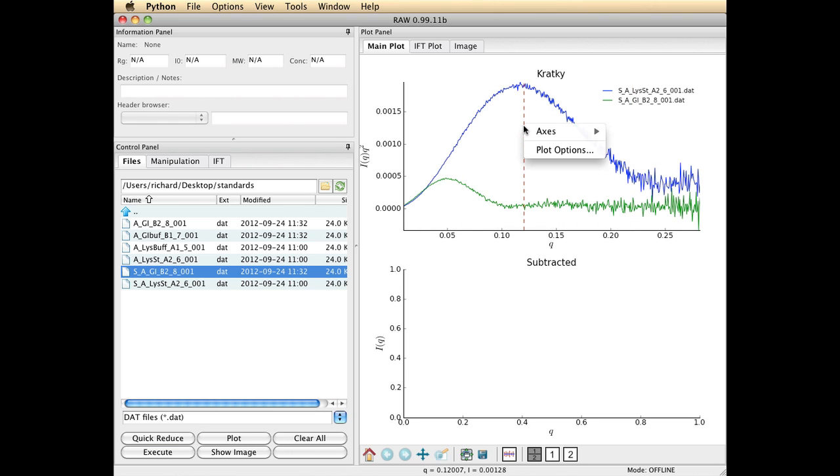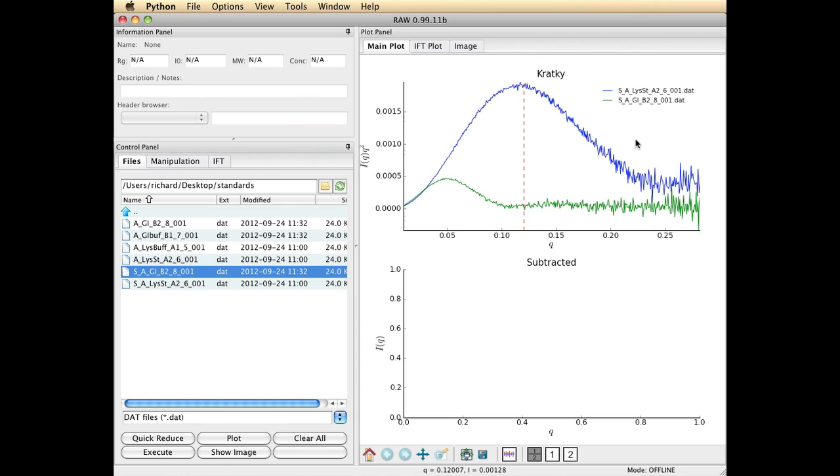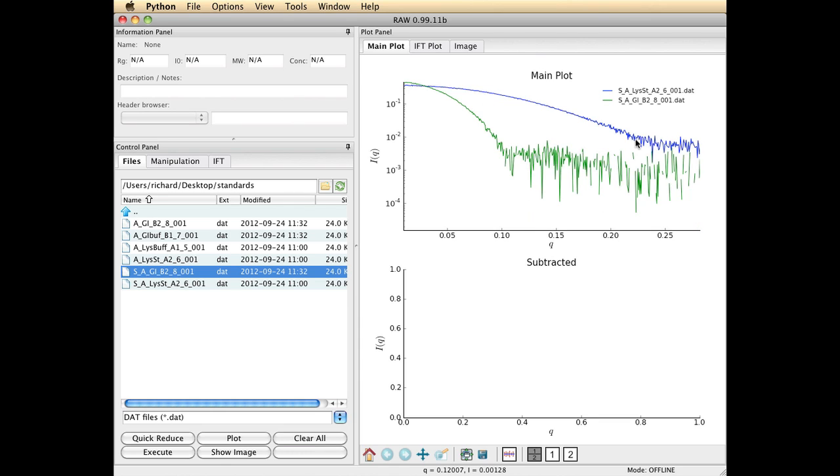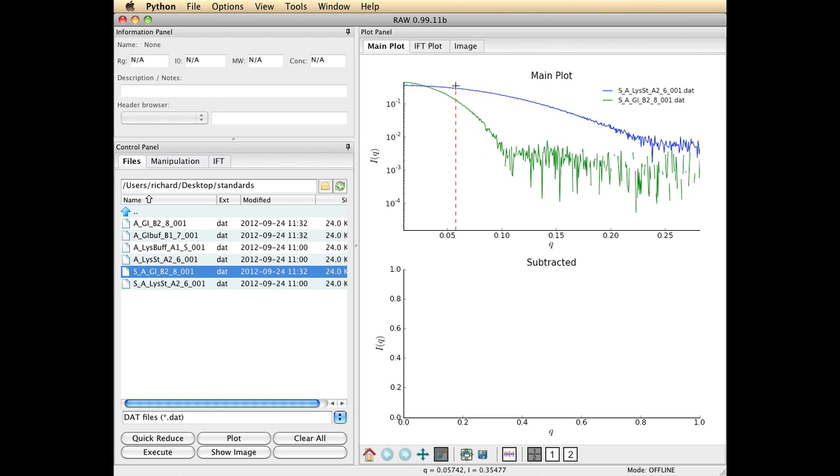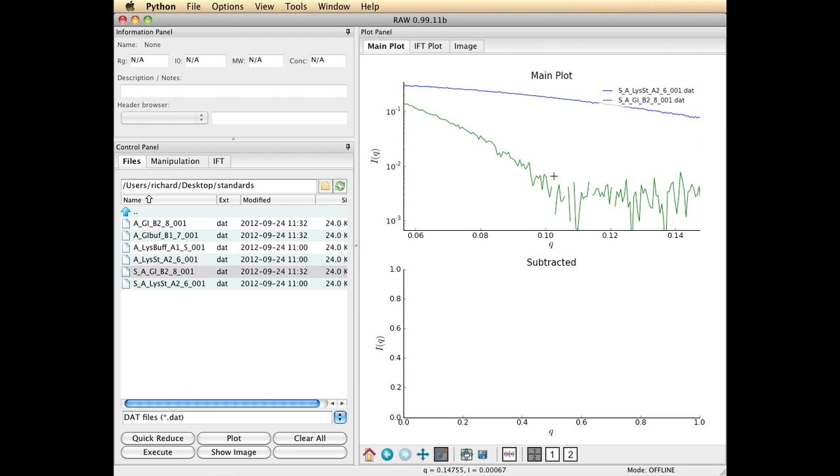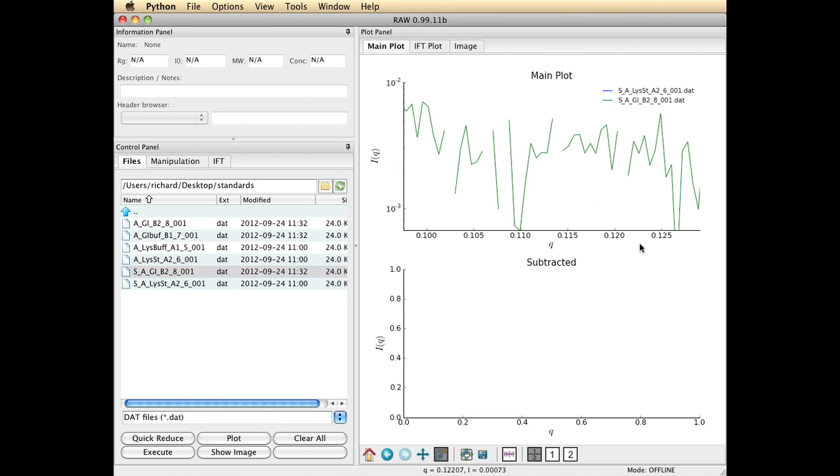I'm going to pop it back to the log-lin plot because that's the handiest for now and show you a couple more ways to manipulate these images. At the bottom of the screen, you'll see several tools. For example, the magnifying glass tool does exactly what it would appear to do in that you can drag a box and you can zoom in on a portion of the screen.